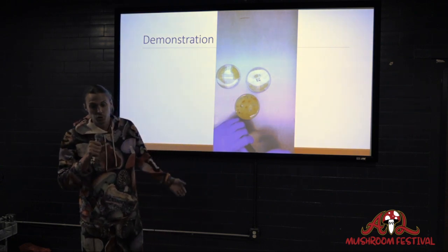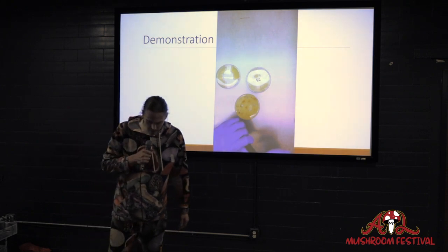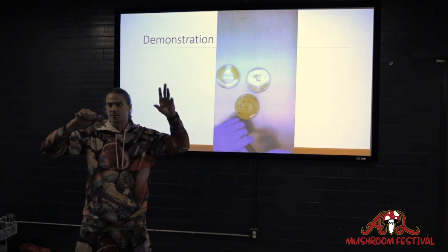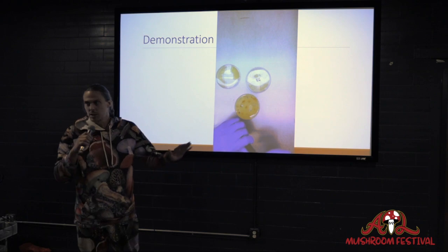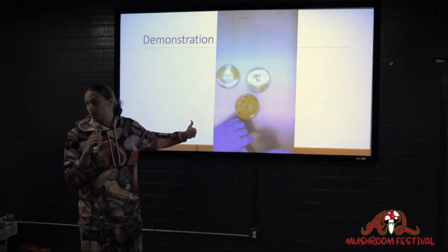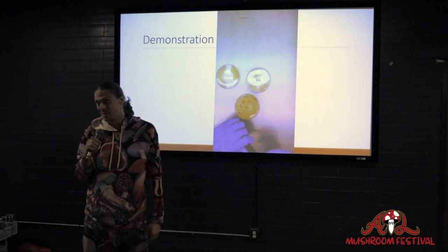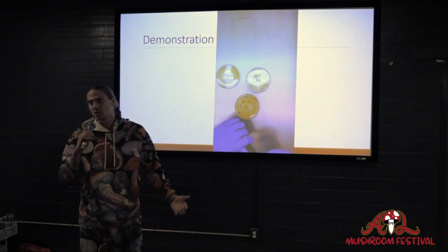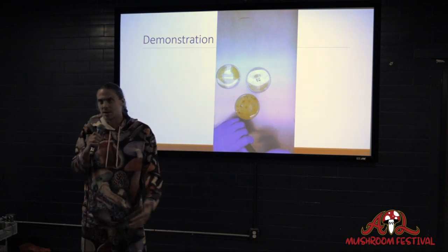And if you're trying to be fancy and you got on some website, whatever, the Shroomery or something, and all these people are raging about, oh, I've got all these antibiotics on my plate, trying to be a cool kid. That's great too, but that's already 15% effective, and that was after doing it twice. So you've got an 85% chance it's still contaminated, and that's after doing the whole thing 2 times. So why waste your time and your money to try and work with something that isn't working with you and is working against you?